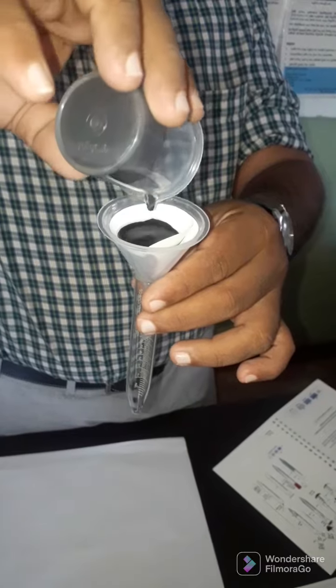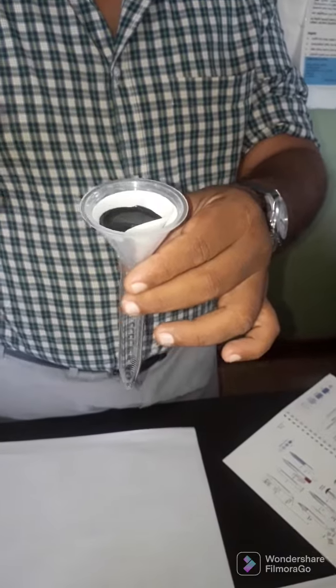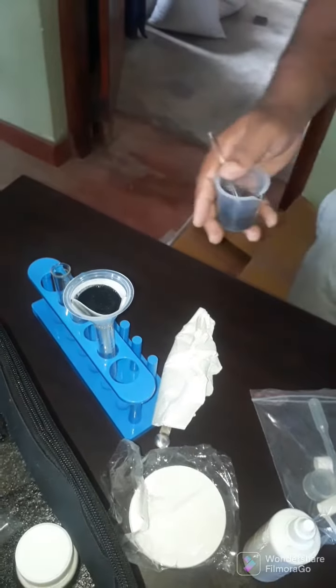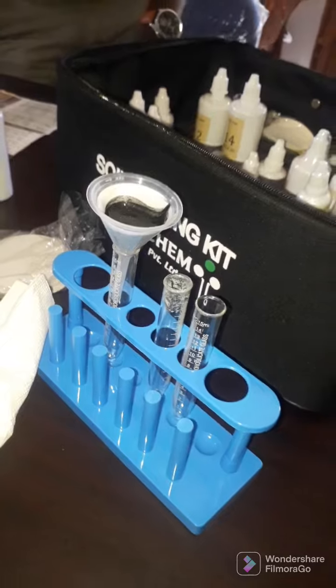For that we have to do filter like this. To filter we can use filter paper. We can keep like this. We can use filter tray to do properly filtering.